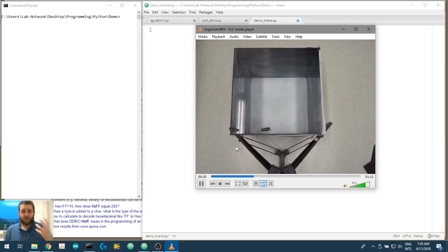So he's just going to run around. The sorts of experiments that we do here are called open field tests, where you can put a standard mouse or a rat in there, and you can measure for 5 minutes or 10 minutes where that animal goes, and if it stays still, or if it rears on its back legs, or if it sniffs, or if it grooms. So it's quite simple, and analysis can be done.